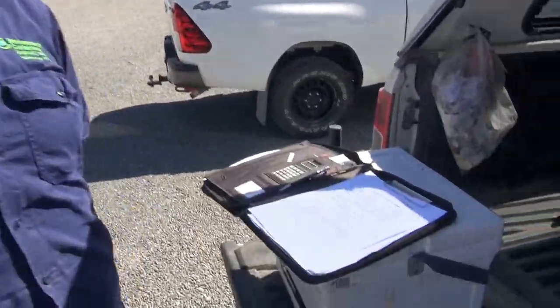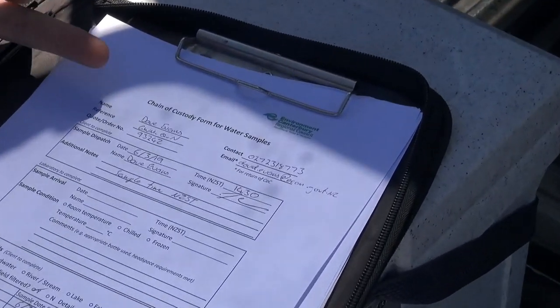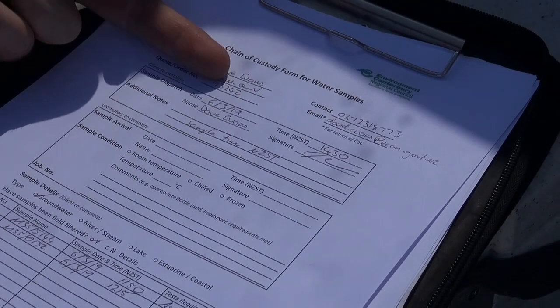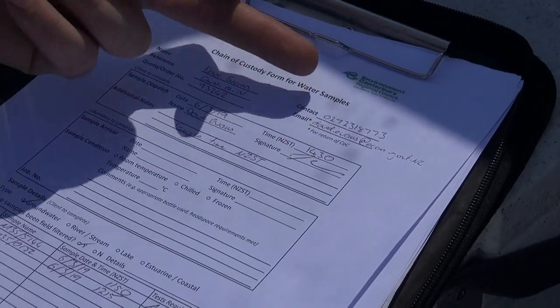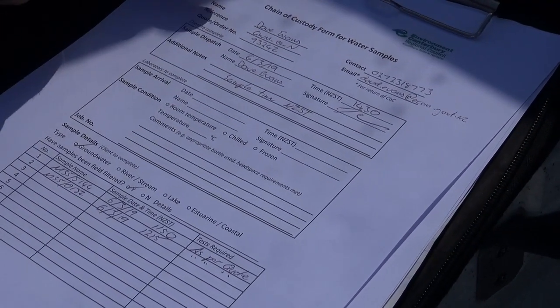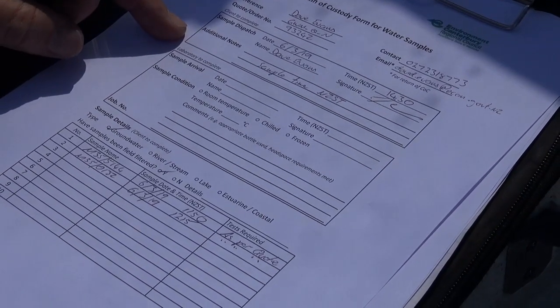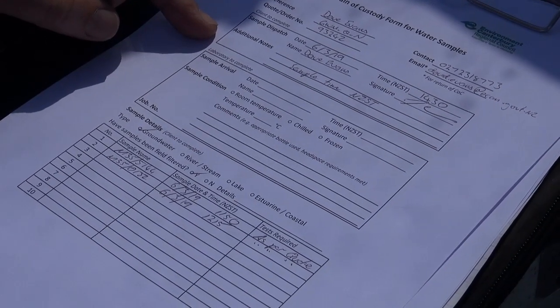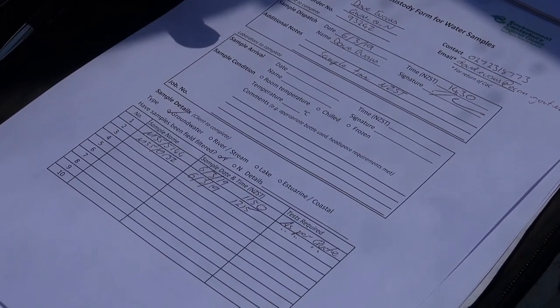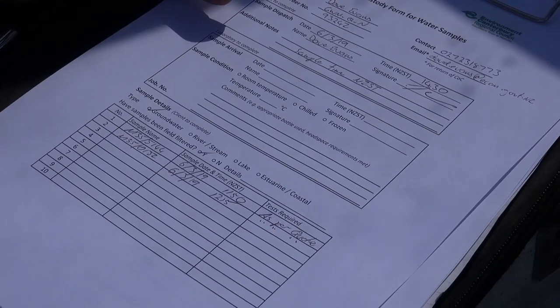The last thing before sending the samples off is to fill out the chain of custody form. It's a simple procedure: just your name, the reference of the programme — for us it's groundwater monitoring quarterly north — contact details, sample dispatch details, and who dropped them off. Additional notes might include things like samples being too turbid for field filtering, or adding a test not in the original quote — anything that pops up that may affect the sample itself.